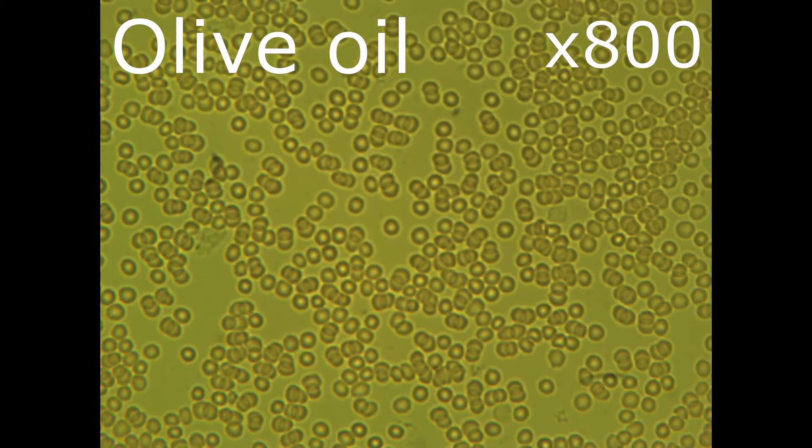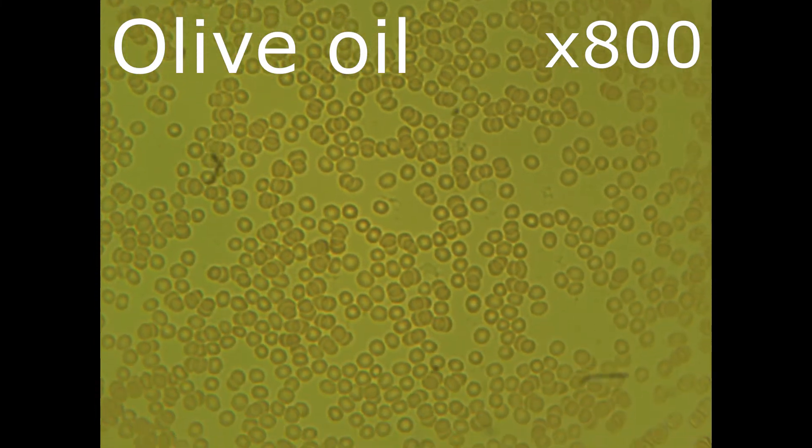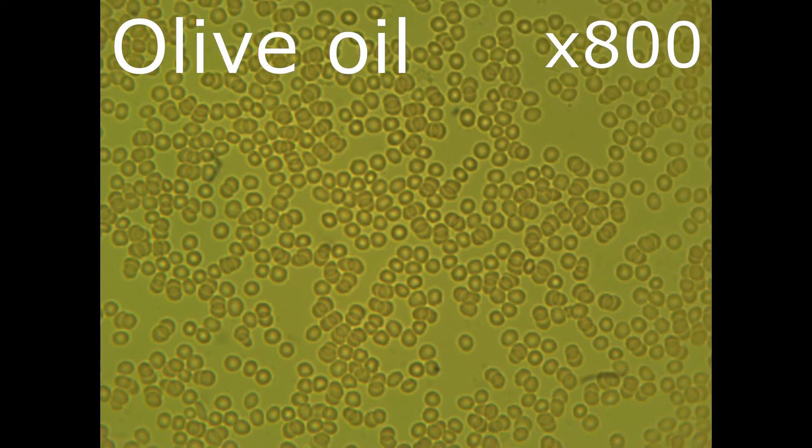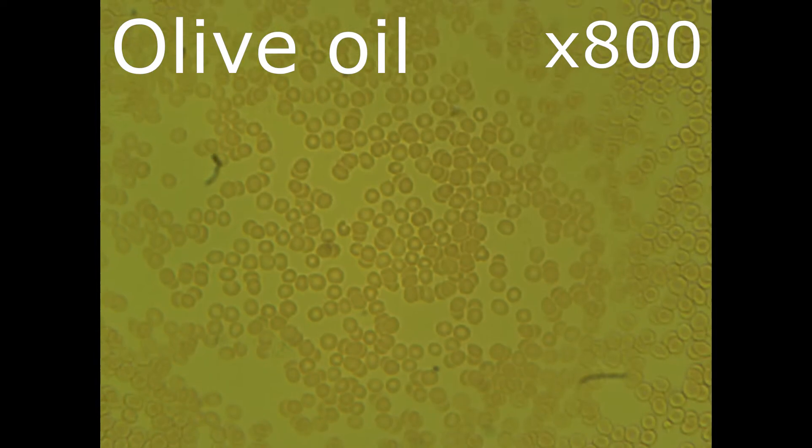Let's have a closer look, zooming to 800x. It looks similar to the blood before taking the olive oil. The small chains of glued erythrocytes are still there and they started to glue to each other, forming islands.